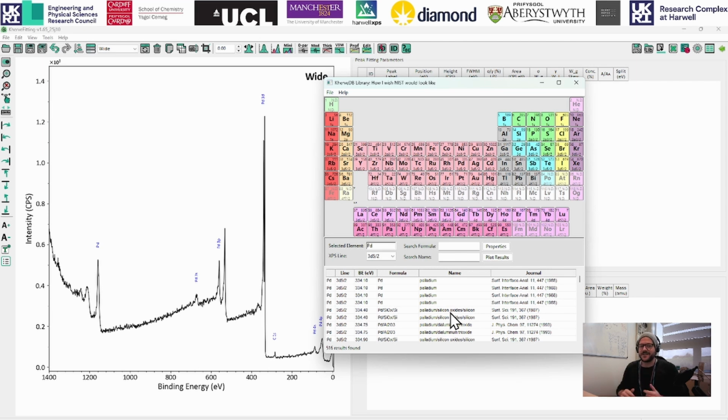Don't just go around and say, I've got a peak at 33.7, this is exactly what this should be. You still need to use your analytical tools, your analytical senses, to make sure that you're not mislabeling, you're not misidentifying anything. But as a guide, absolutely fantastic. So big thanks to Gwilherm for introducing this.